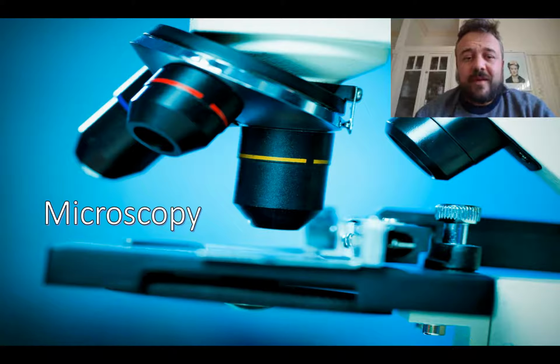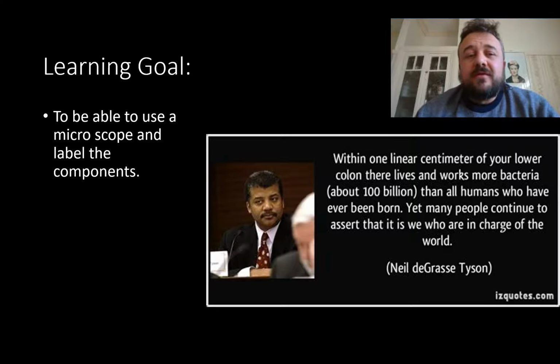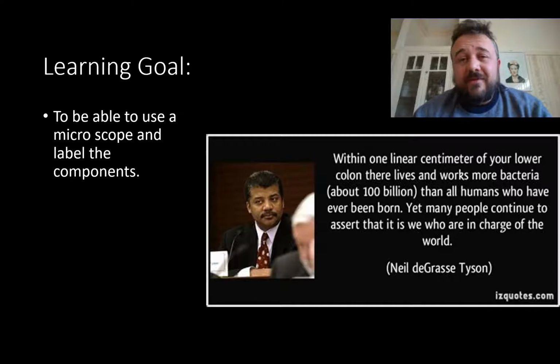Alright nerds, so let's talk about microscopy, or for another turn of phrase, using microscopes. By the end of this, we want to be able to use a microscope and label the components. We're not going to show you a microscope directly, we're going to show you some pictures, and hopefully you can use the instructions that you write down here to put a microscope in front of you, and away we go. Unfortunately, I just don't have access to a microscope at home to make these videos with.